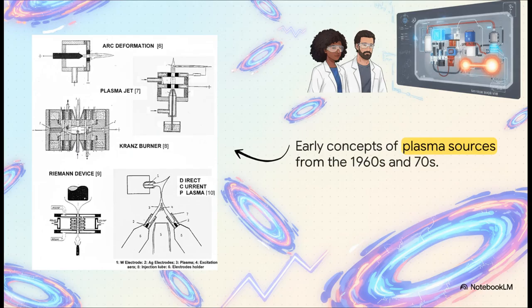What's really interesting is how they essentially paved the way for spectroscopists like Greenfield and Boumans to harness the high-temperature induction plasmas we rely on today, literally changing trace elemental analysis forever.